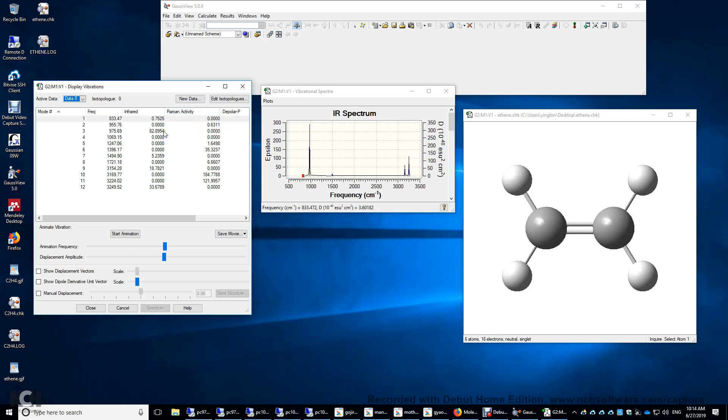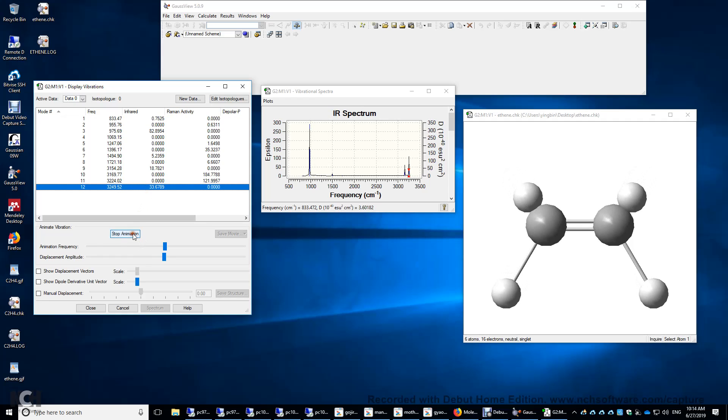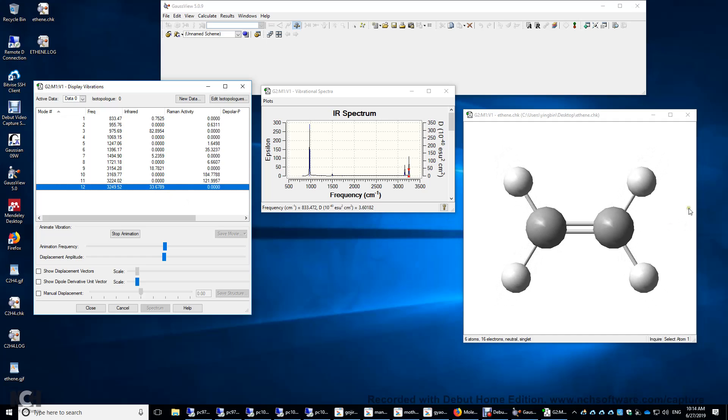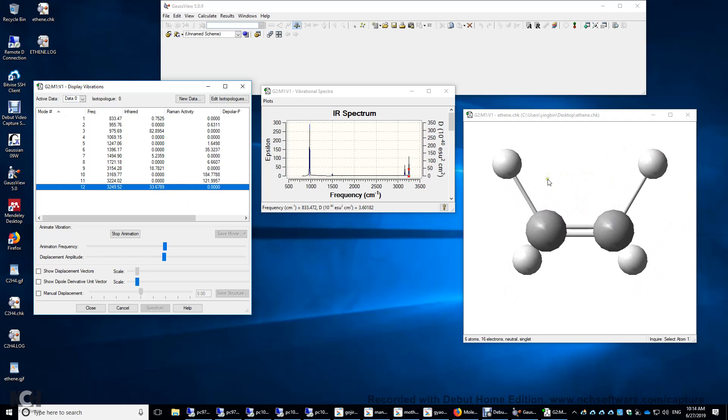Now let's look at a few vibrational modes. Let's look at the first one, number 12, with the highest vibrational frequency. Start animation. And this mode changes the dipole moment. Therefore, it's infrared active. But it does not change the polarizability of the molecule. Therefore, it's Raman inactive.